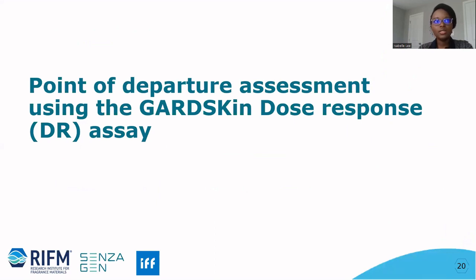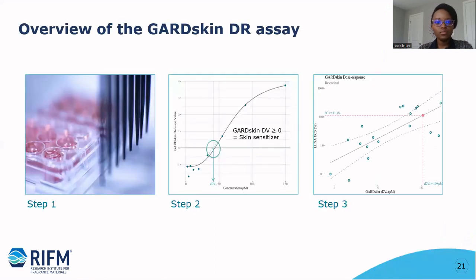So just to get into the second assessment, the GARDskin dose-response assay that we are working on with Sensitization and RIFM. So you're all probably familiar with the GARDskin assay. This was recently introduced into the OECD guideline 442E, and it looks at the dendritic cell activation.